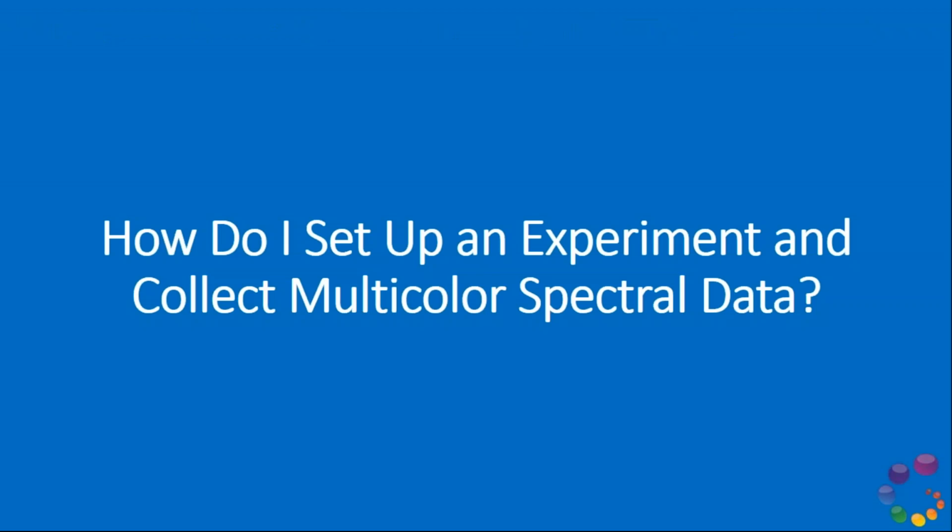So how do we get there? How do we generate all of this data on our spectral cytometers? I'd like to walk you through that workflow and show you how easy it is to get through the SpectroFlo software.